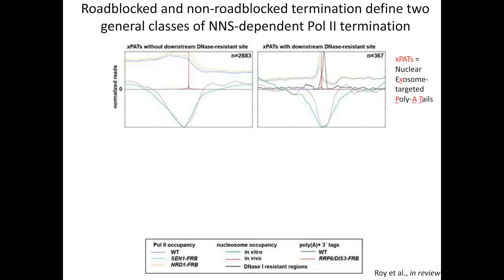And so we wanted to take a step back and look at all of the clusters that we identified with the 3' sequencing. Here we're looking at all roughly 3,000 clusters, and we're separating them on the basis of whether or not they have a DNase-resistant site. When we map the RNA polymerase II occupancy on these two data sets, we see vastly different behaviors. In the absence of a downstream DNase-resistant site, we see that RNA polymerase II begins to accumulate near the termination site, indicating pausing, and then at the termination site rapidly falls off.